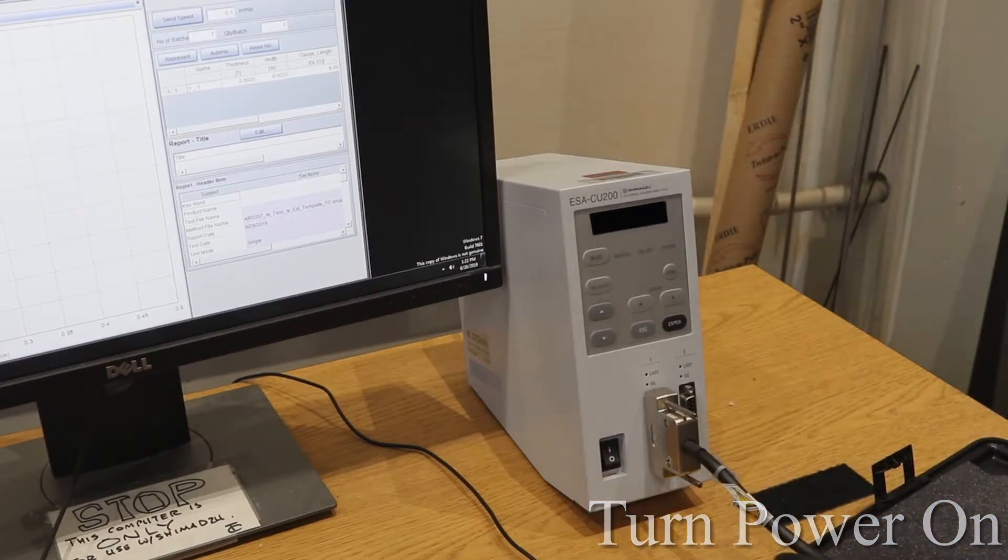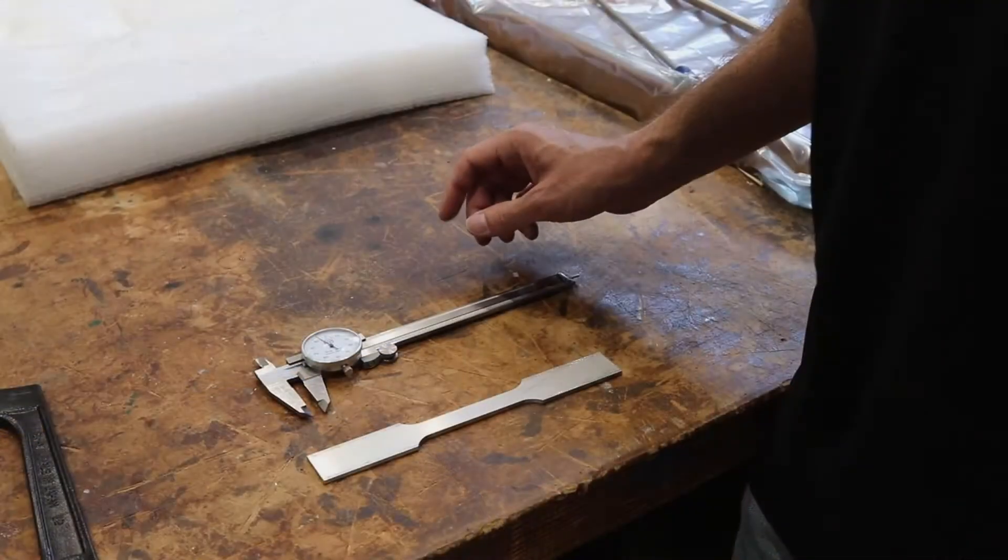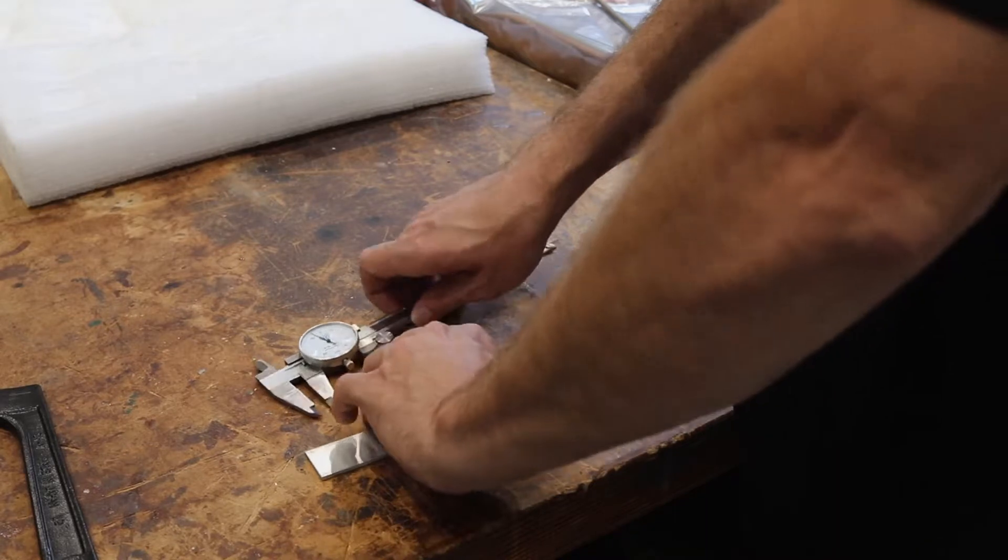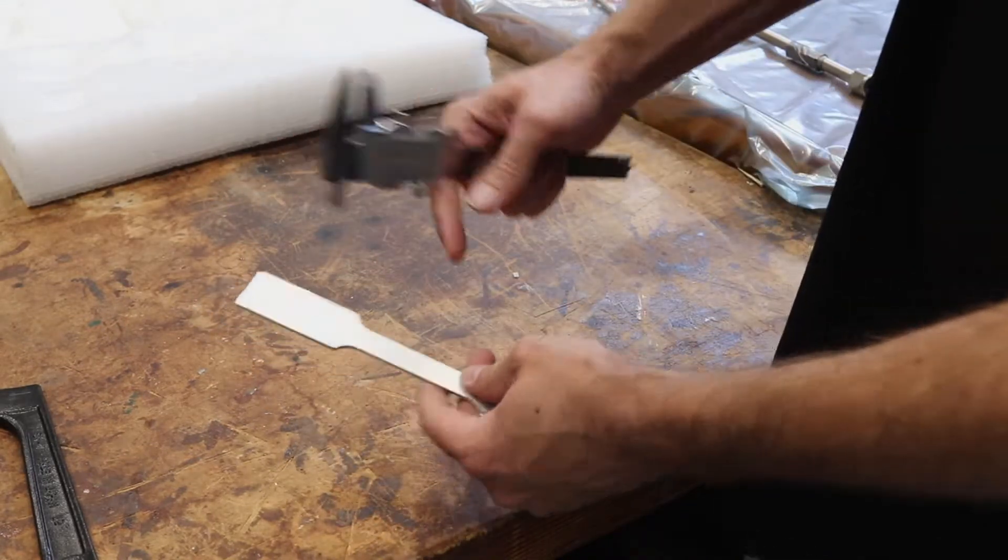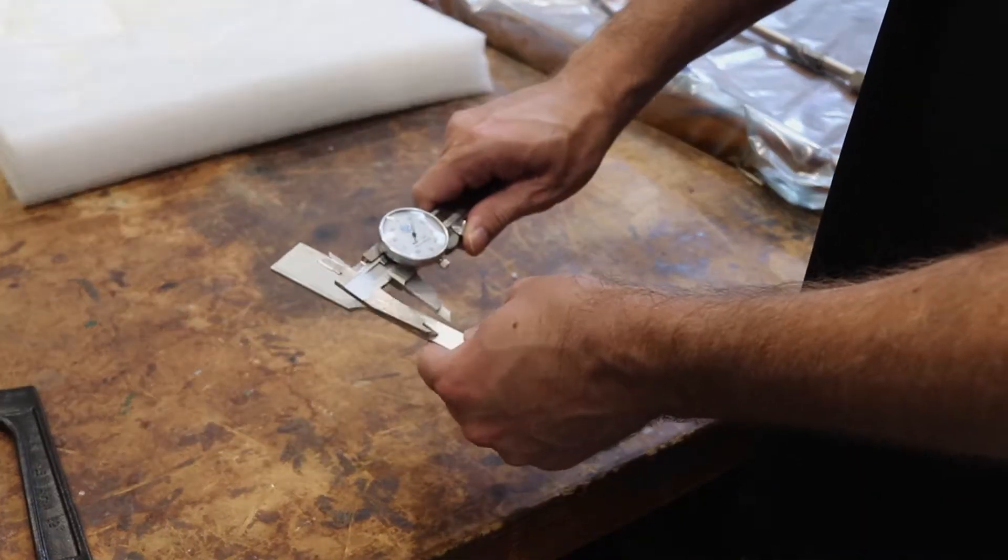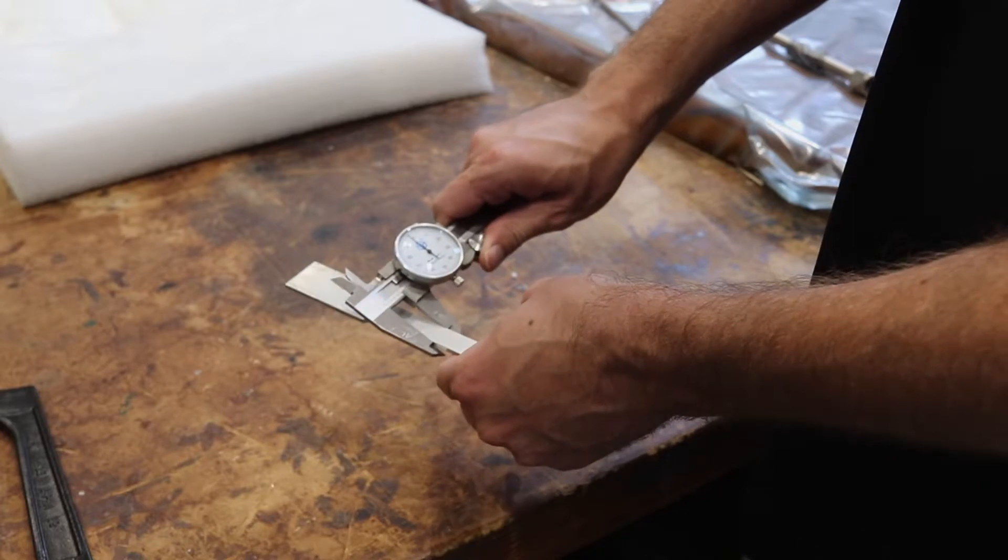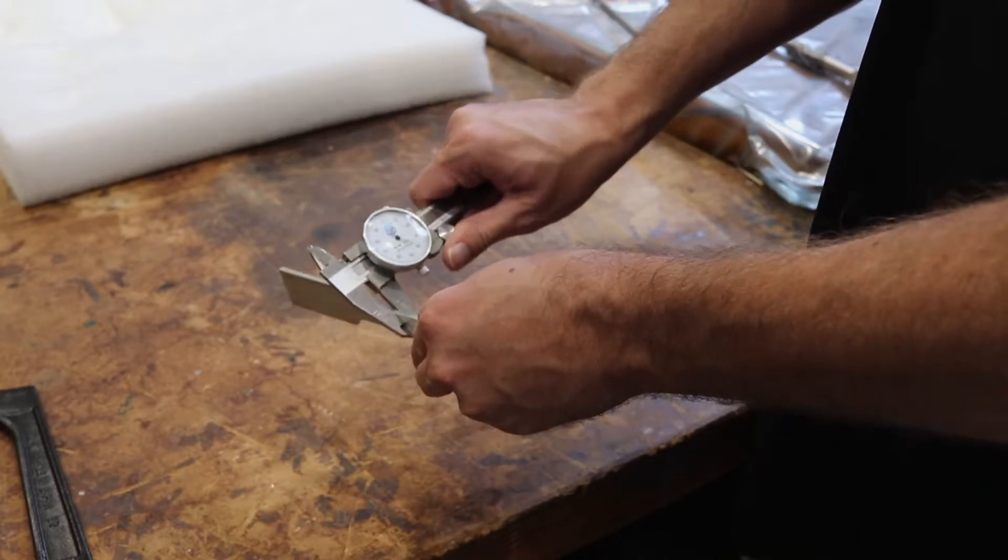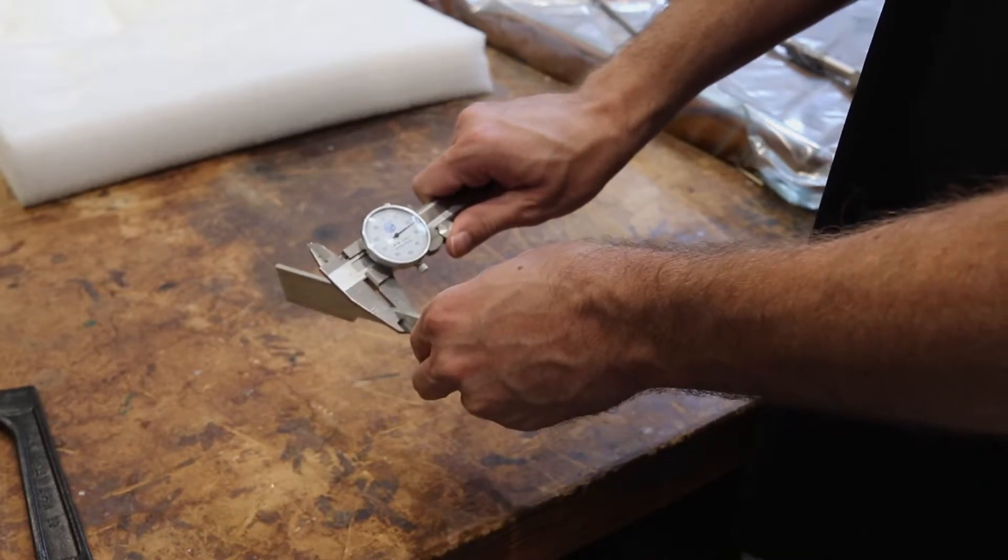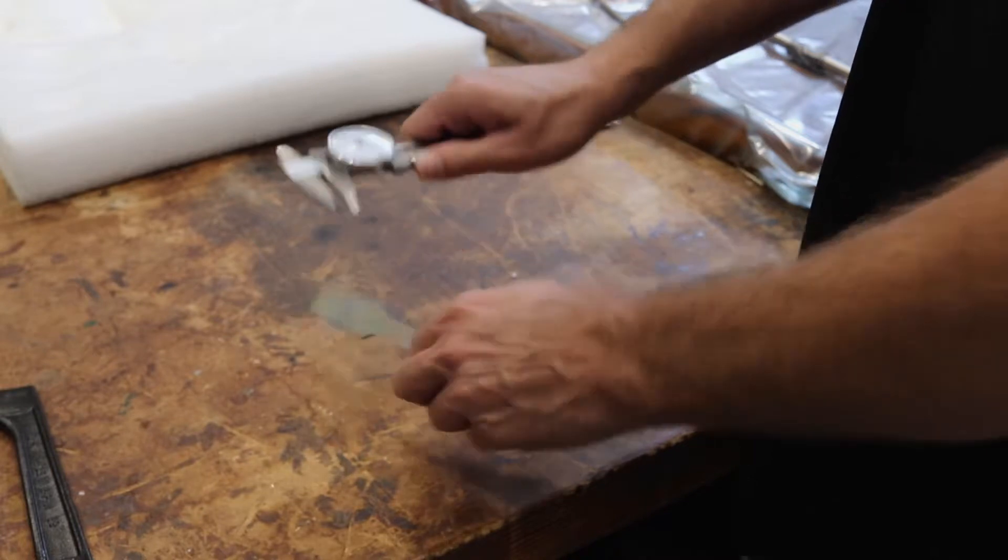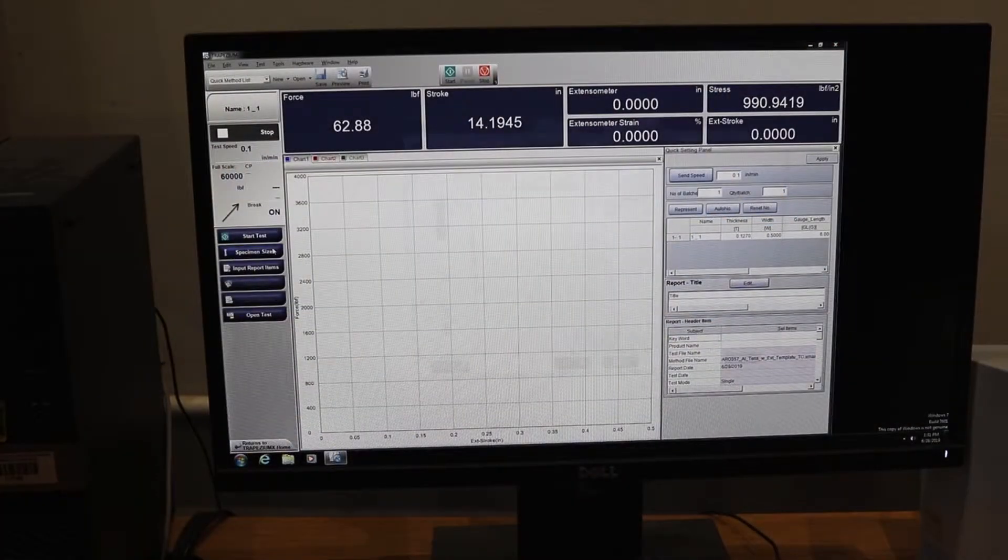Our next step involves measuring our specimen. The important measurements involved are the thickness and the width at the smallest section of the dog bone. If you are unfamiliar with using calipers there is a video available. Now we will input our measurements obtained into the software.